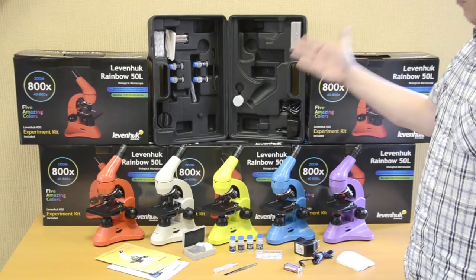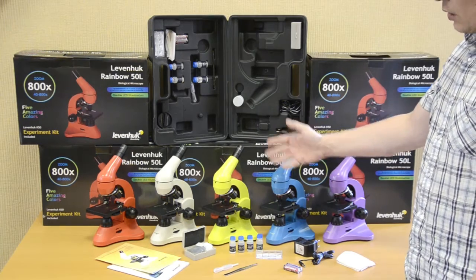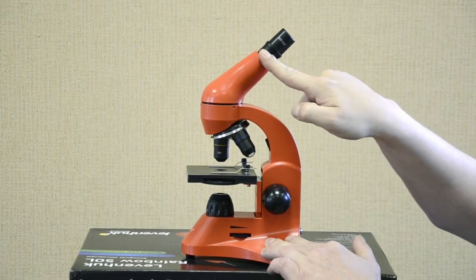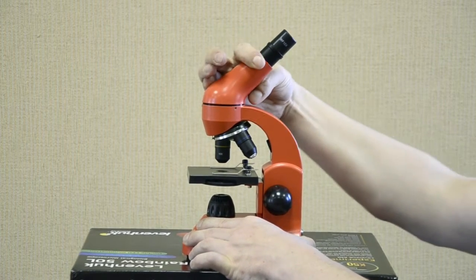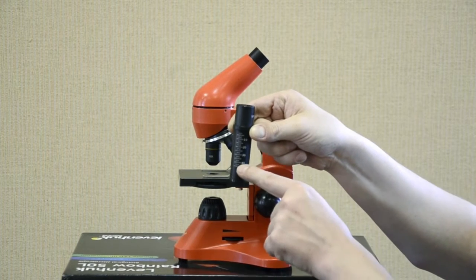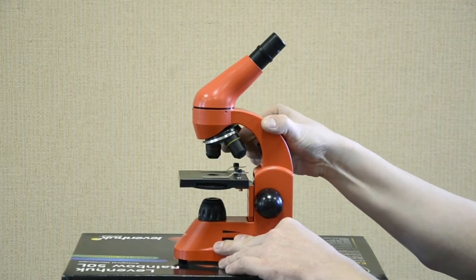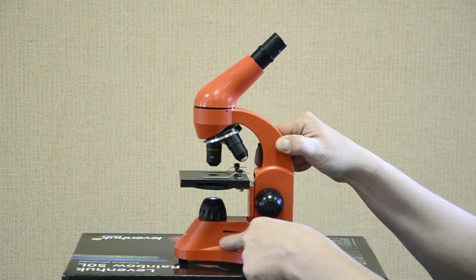Let's now consider the Levenhuk Rainbow 50L color microscope series for children and students. These microscopes feature plastic bodies and come with an experiment kit, user manual, batteries, AC adapter, and dust cover. The head is inclined at a 45-degree angle and is 360 degrees rotatable. The eyepiece is removable with 10X magnification power. A Barlow lens is installed into the tube before the eyepiece. The scale shows available magnification. The revolving nosepiece holds 3 objectives. The focusing wheel is easy to use.